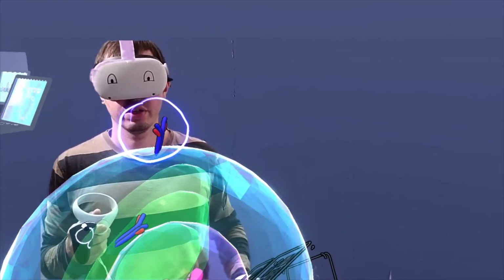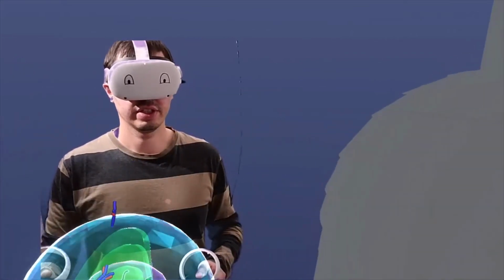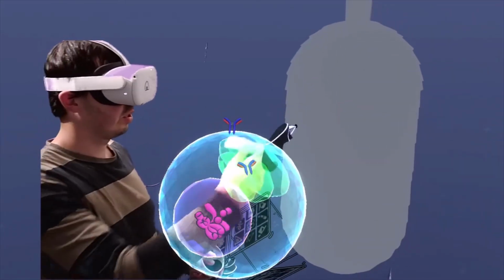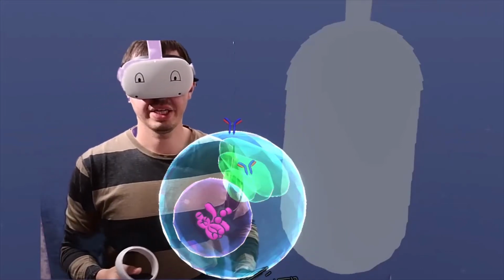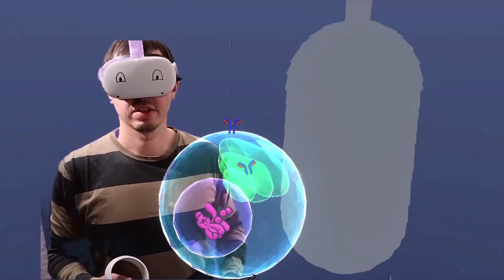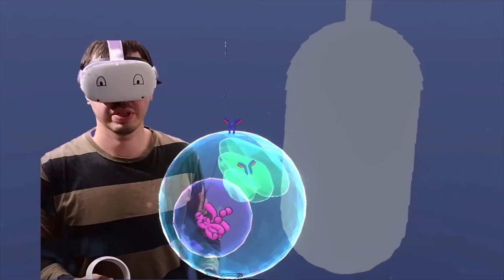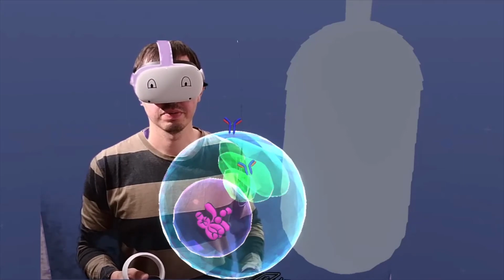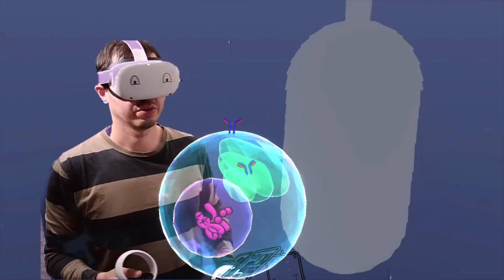So what you need to do now is to put it inside a bioreactor, this thing here. This is where you'll grow your cells, and that will allow you to have large amounts of antibodies, which are going to be used for the tests. In vitro testing, then in vivo testing, preclinical ones, which basically means testing on animals, like the mouse you've used at the beginning of the experiment. And after that, the clinical batches, which are going to be used for the clinical trials.